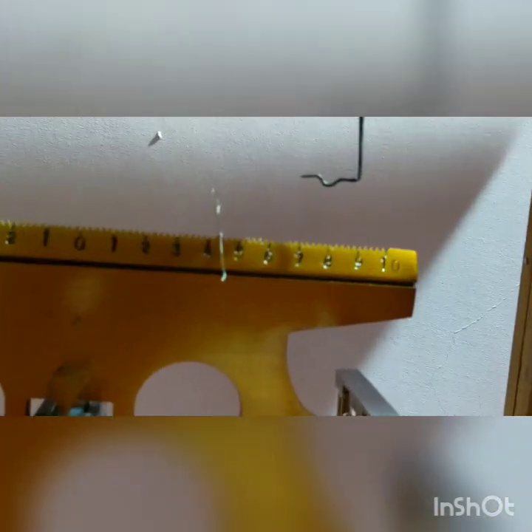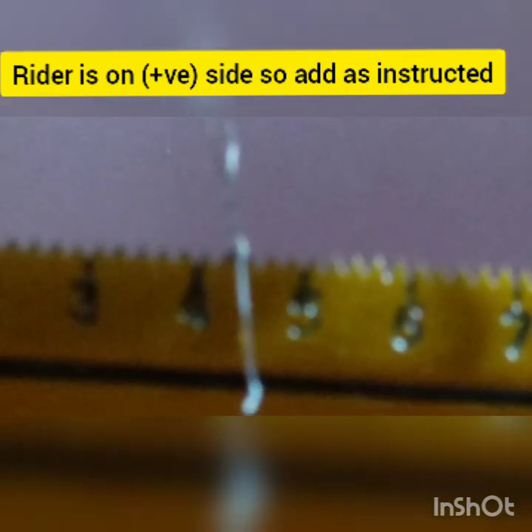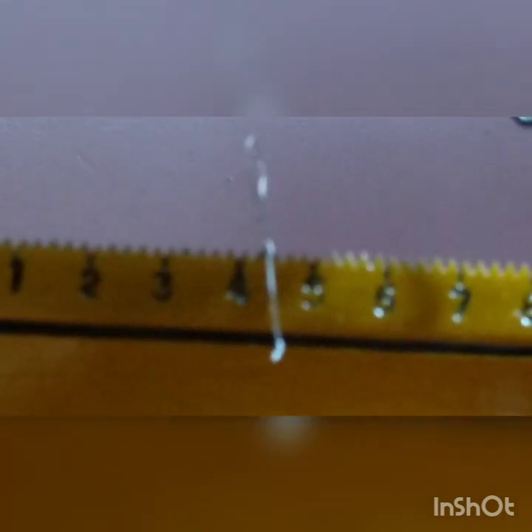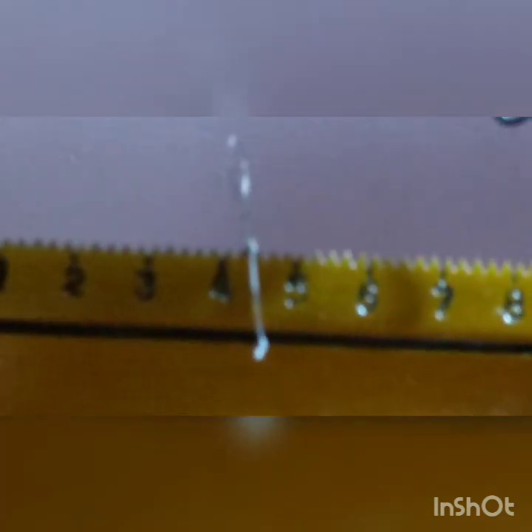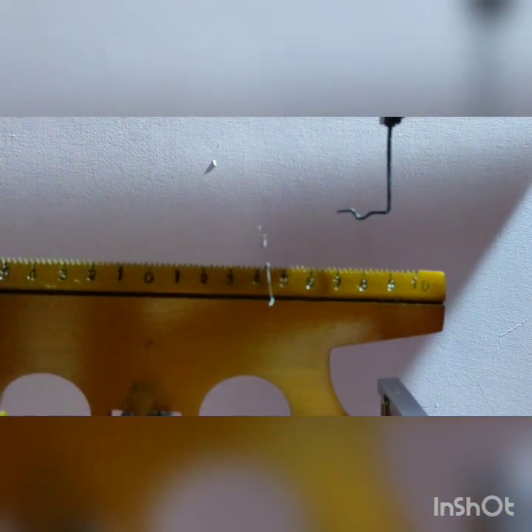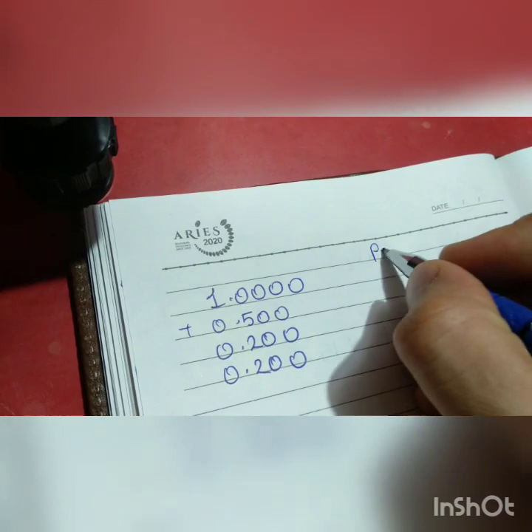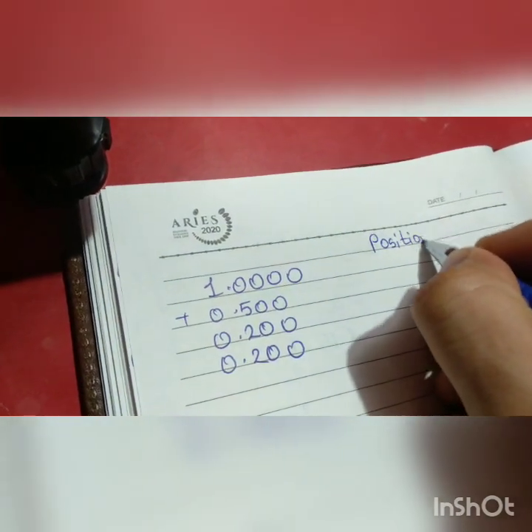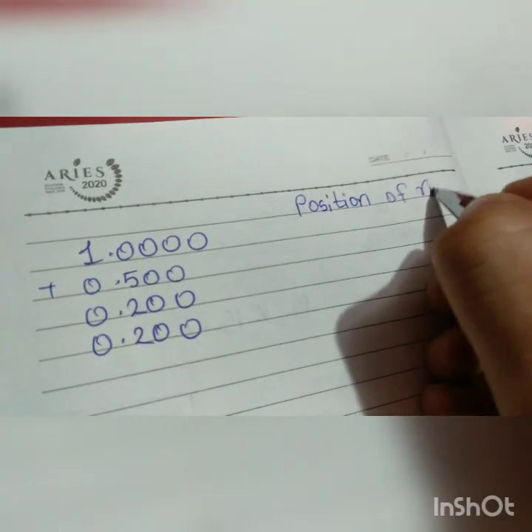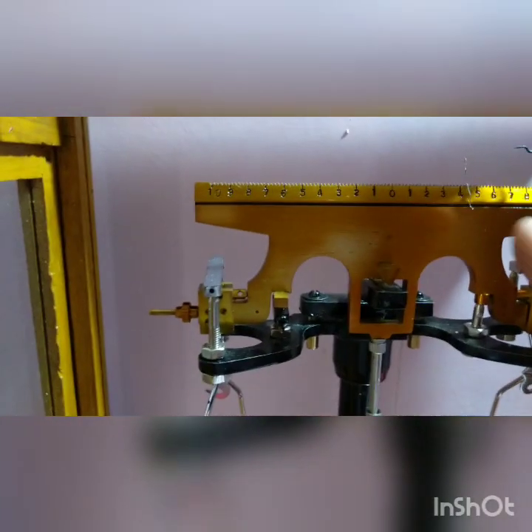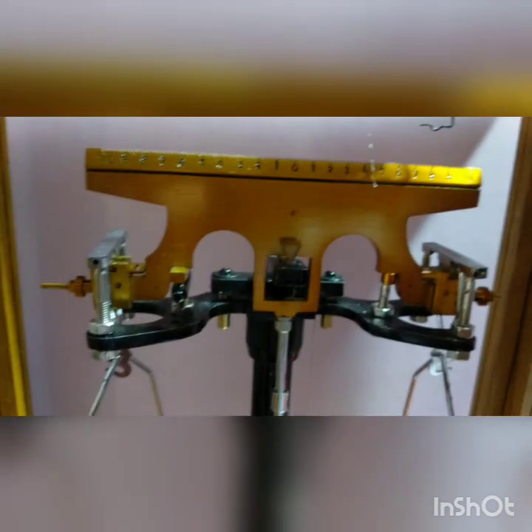Note the position of the rider at which point it is. It is on 4.1 and 4.2. You can see in the camera now, 4.1 and 4.2. Write the position of rider is 4.2 plus. Why plus? Because weights are over on the right pan and the rider is also on the right side, so we will add the weights.